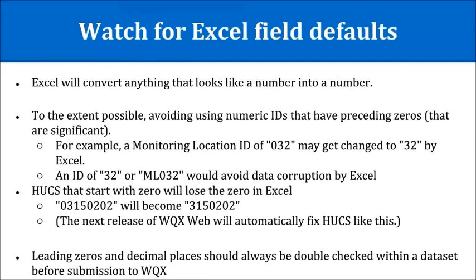Okay, another tip is when you're working in Excel, because we do work with Excel a lot, importing into WQX, watch for Excel field defaults. This is a way to get familiar with formatting within Excel, different data types within Excel. It will convert anything that looks like a number into a number unless you tell it otherwise.